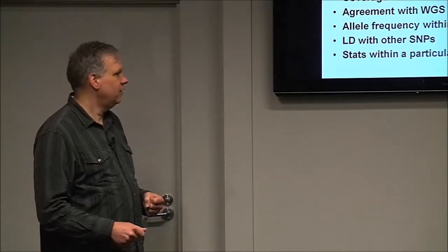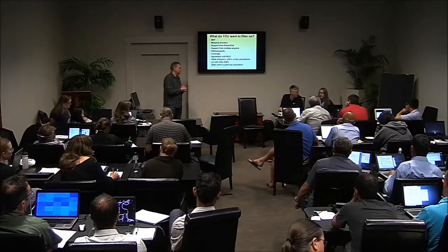Oh, that brings up a good point. A lot of people get really giddy about employing a lot of those filters during the SNP calling procedures. But if you're doing a small pilot study and you want to play around with different types of filtering, keep your filters really low during the actual SNP calling procedure, because as you saw, you can try different filters after calling your SNPs. And some of them are the same filters that you can apply during SNP calling, right? Yes. So it gives you more flexibility.